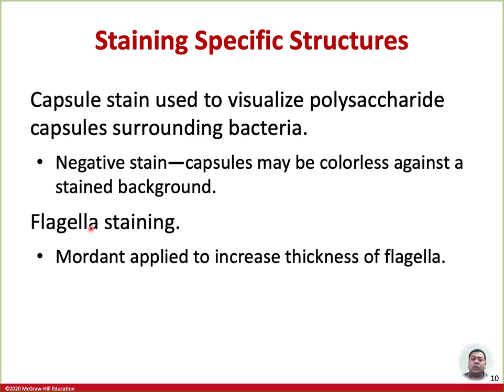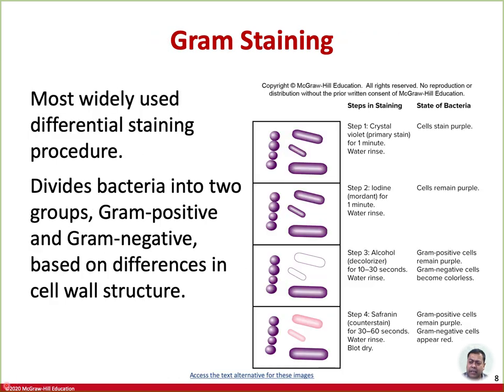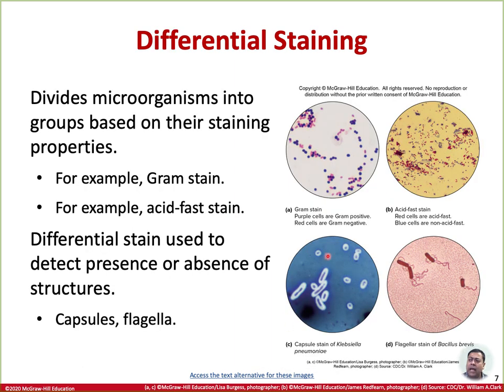There's a little distortion of the cell shape, and the cell can become counter-stained for even greater visibility. So let's take a look at the picture, and we will just repeat what we have just said. Say, for example, we are looking at this picture right here. The background looks bluish, but it is essentially blackish. It's just a little bit pseudo colored in the process of the picture.